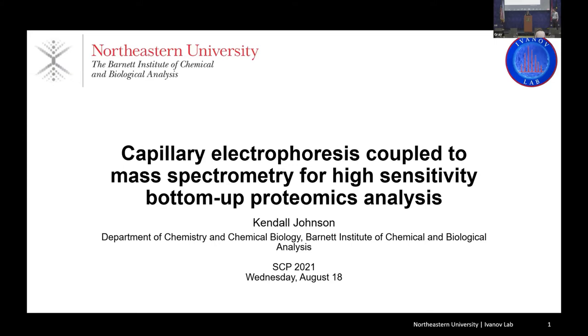And I think today she's going to be discussing or contrasting liquid chromatography and capillary electrophoresis separatory methods, which is of primary interest to a lot of us who typically use liquid chromatography. So it's going to be really neat to see what we're missing out on by just sticking to that separatory mechanism. So with that, welcome you to the stage.